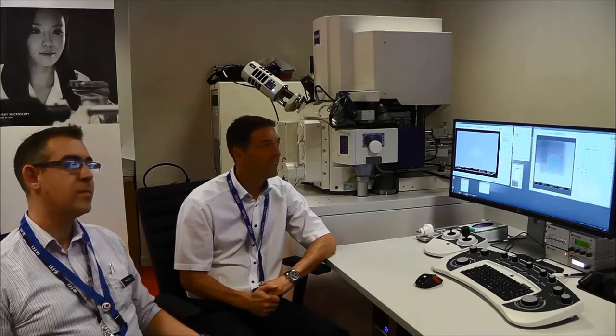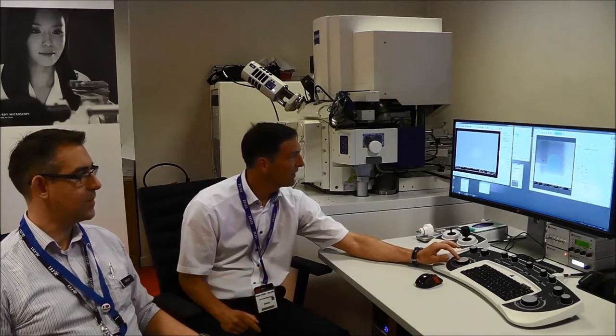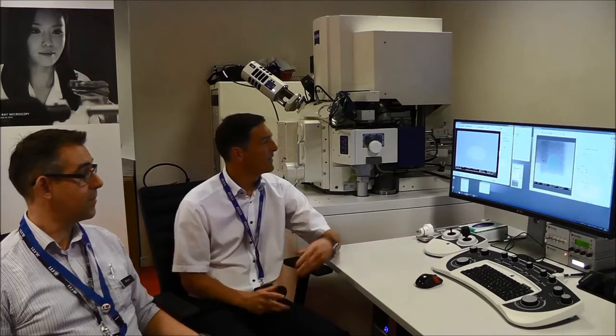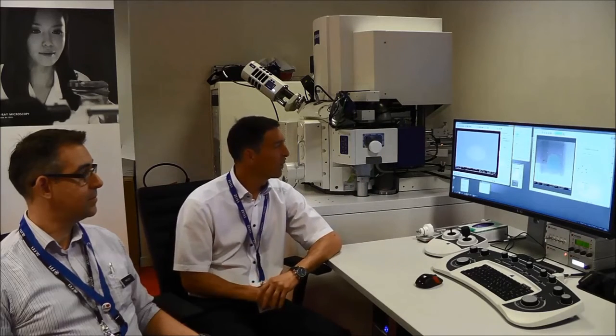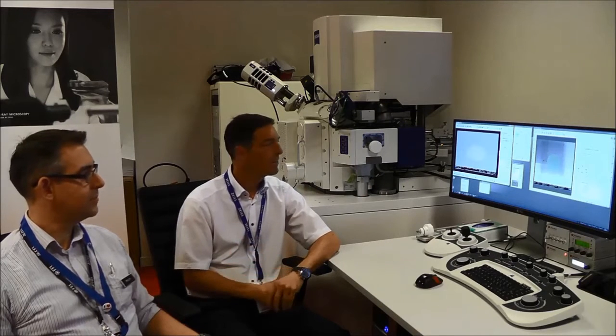At EMC this year we're showing the CrossBeam instrument. We have a CrossBeam 540 here and right now you can see the instrument working — we are milling just a spiral in a substrate, and while we are milling we're imaging live what we're doing. This is our standard mode of operation.